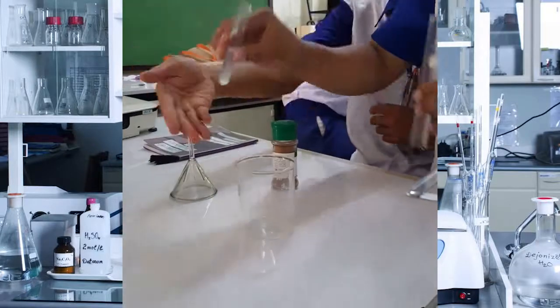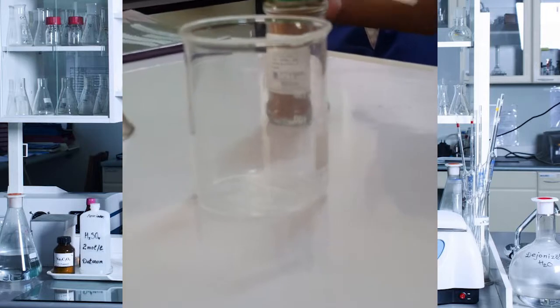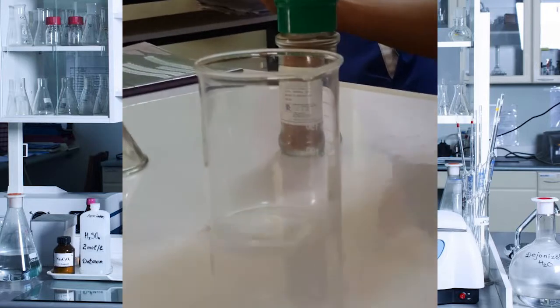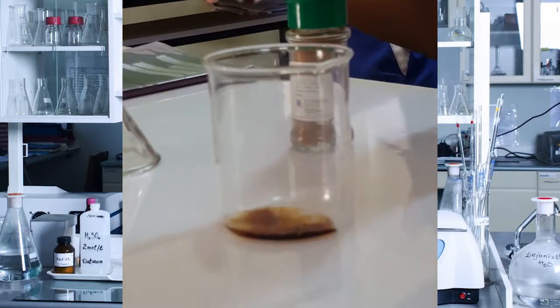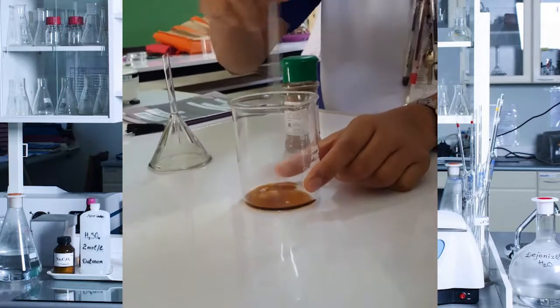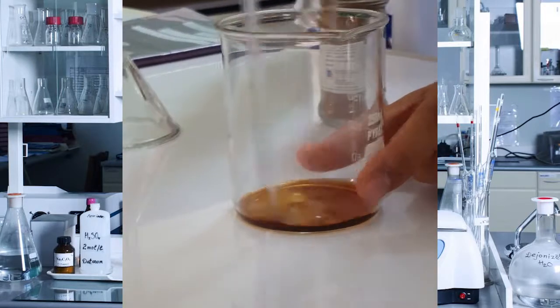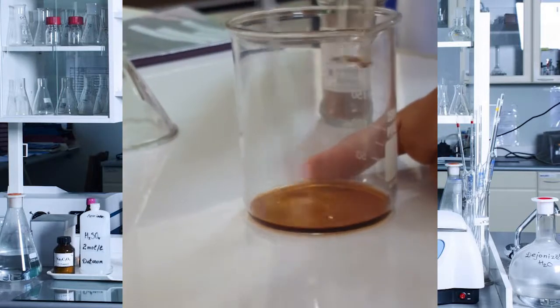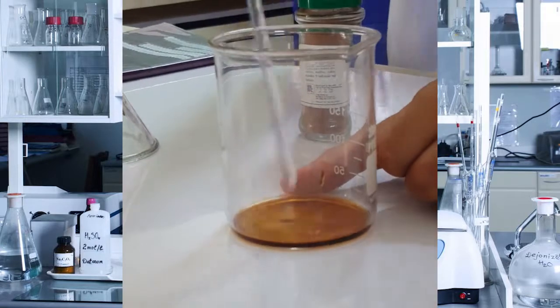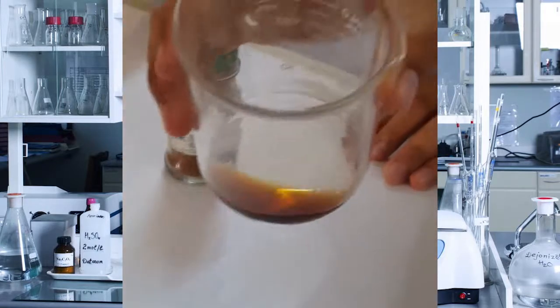We have the beaker and their substances are toyo at suka. We have to mix the toyo at suka in the beaker. After that, stir it with your stirring rod. As you can see, no changes happen when you mix the two liquid condiments.